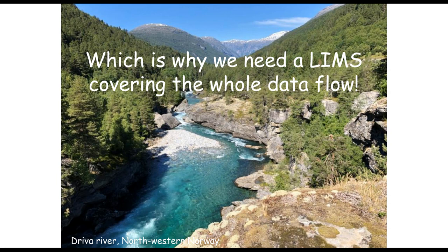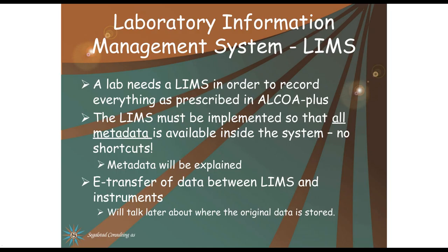This is all quite complicated, especially if we use a paper system. We will need logs for which reagents and standards we used and how they were made. We will also need logs for instrument, maintenance, calibration, use, and of course, which of the same type of instrument we used. The conclusion is that we do need a LIMS.